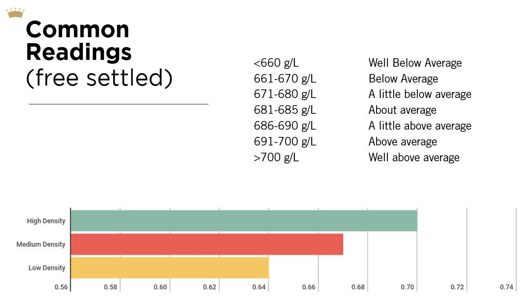0.66 or 660 grams per liter measurement tends to be what I would consider well below average. It's the 670 to 690 range that tends to be our sort of average range, whereas anything above that 700 grams per liter mark is definitely well above average. These are based on observations of about 4 years worth of crown analyses of a couple hundred different coffees using both the manual and a method on the Sinar Bean Pro.